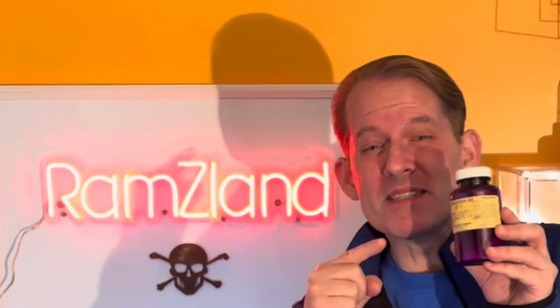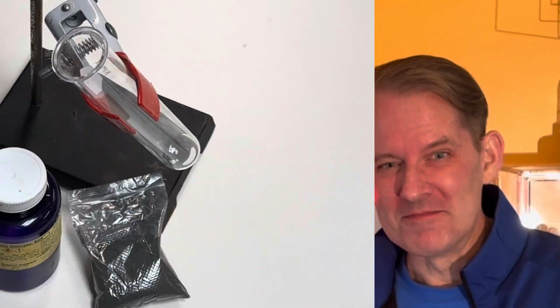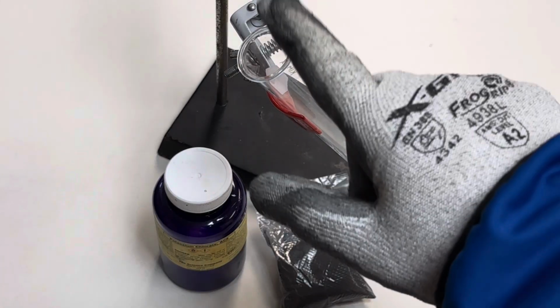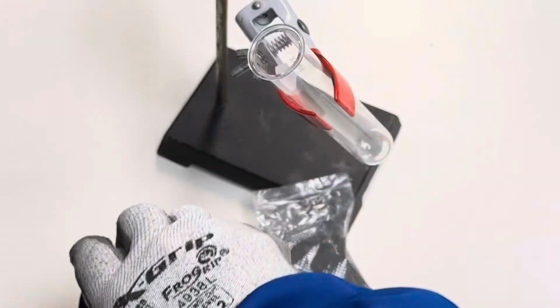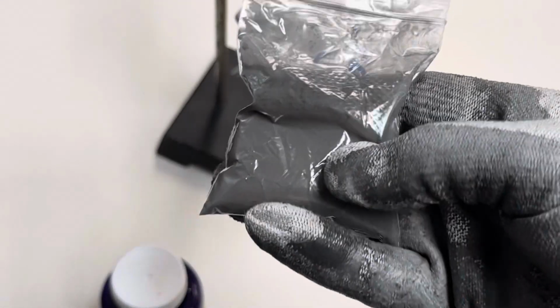Welcome back to RamZland. Today I want to show you the awesome redox reaction between potassium chlorate and nickel. Check this out. For this experiment, we'll use a test tube stand, potassium chlorate as the oxidizer, and nickel as the fuel.